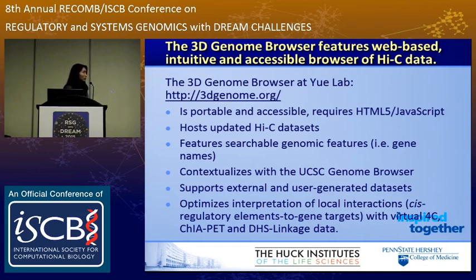features to address both of these problems of Hi-C data and to really increase the accessibility of Hi-C data to, I guess, the general scientific community. I'll highlight some of the features as I go on.